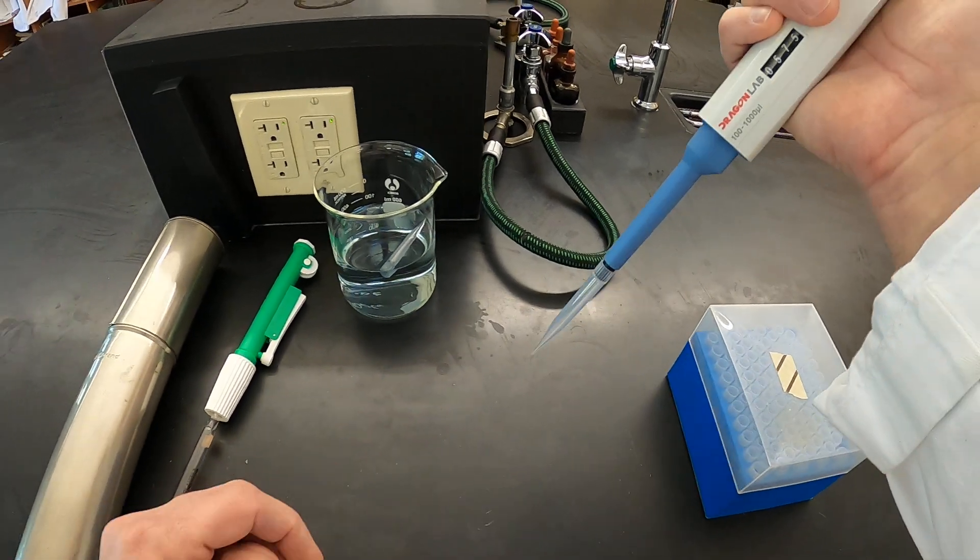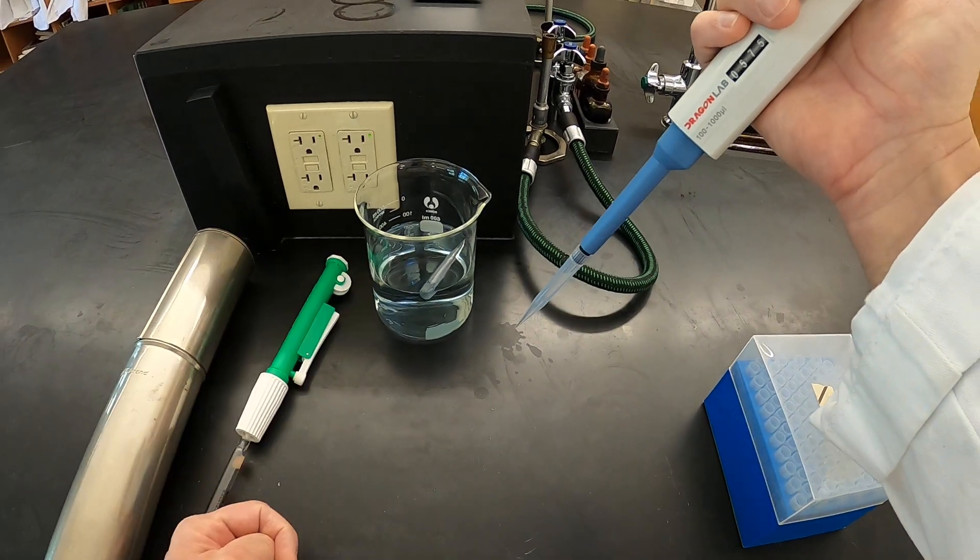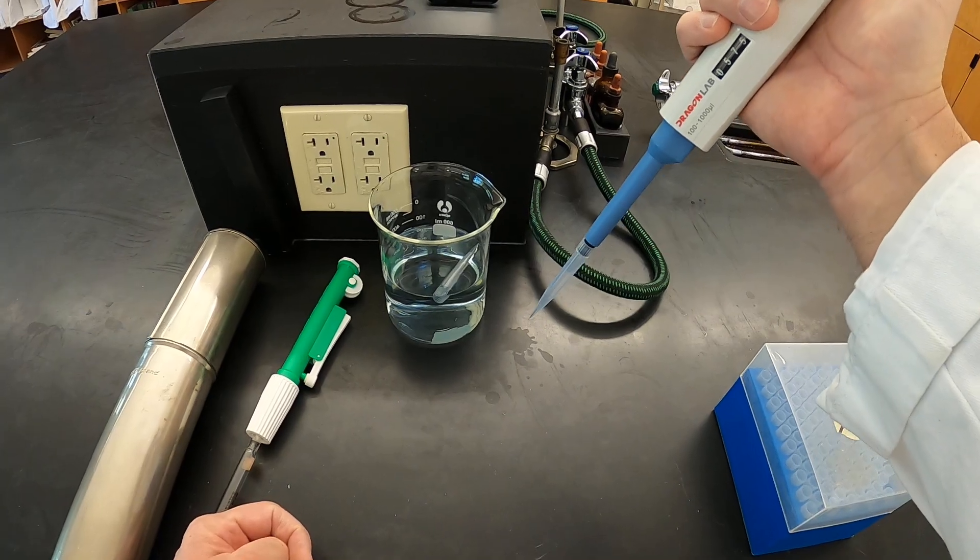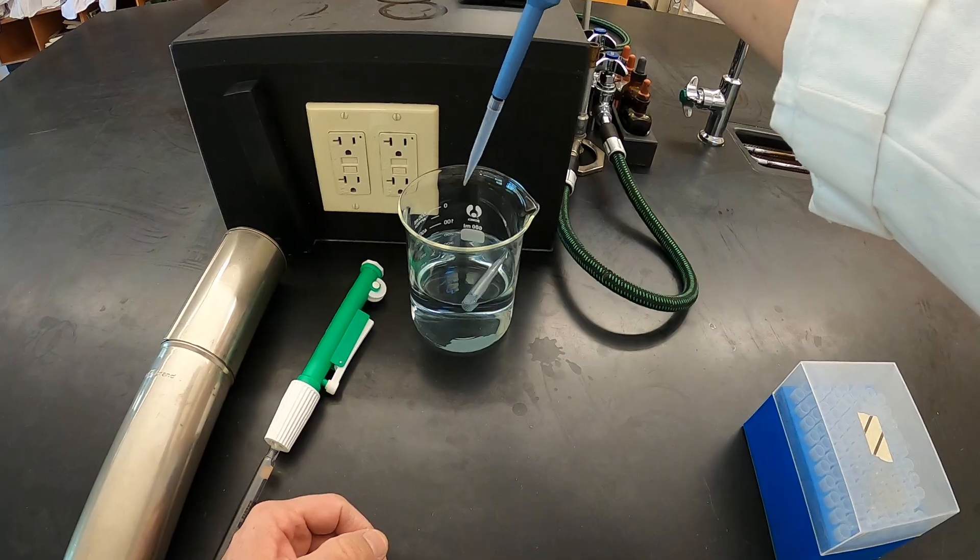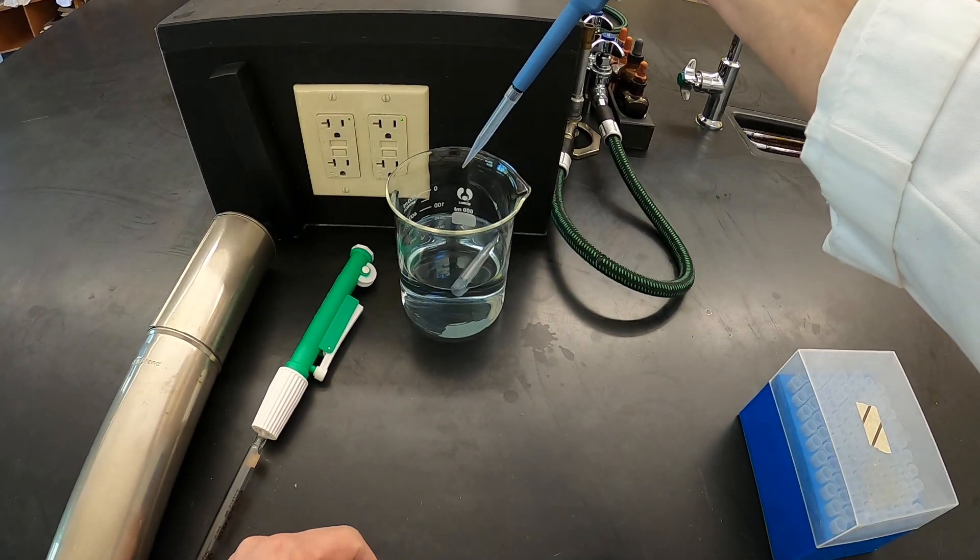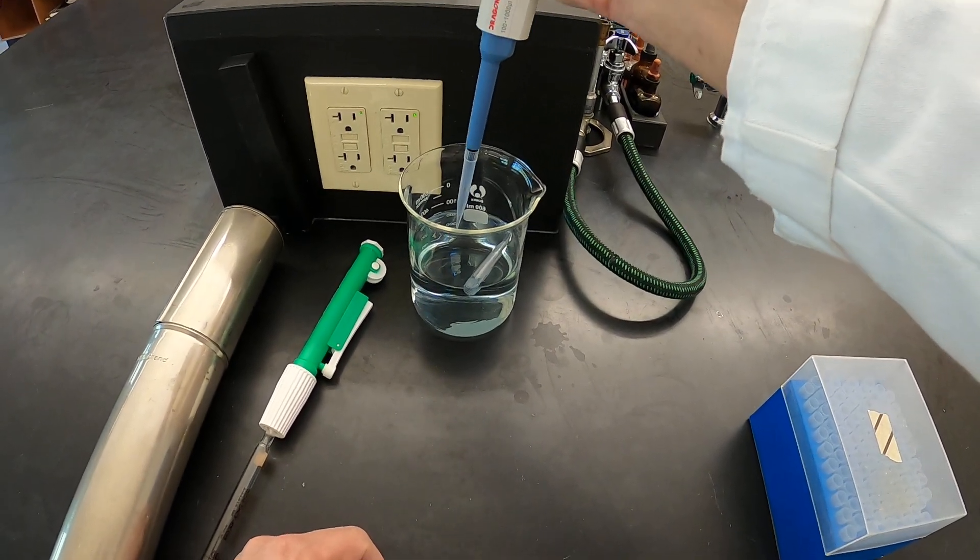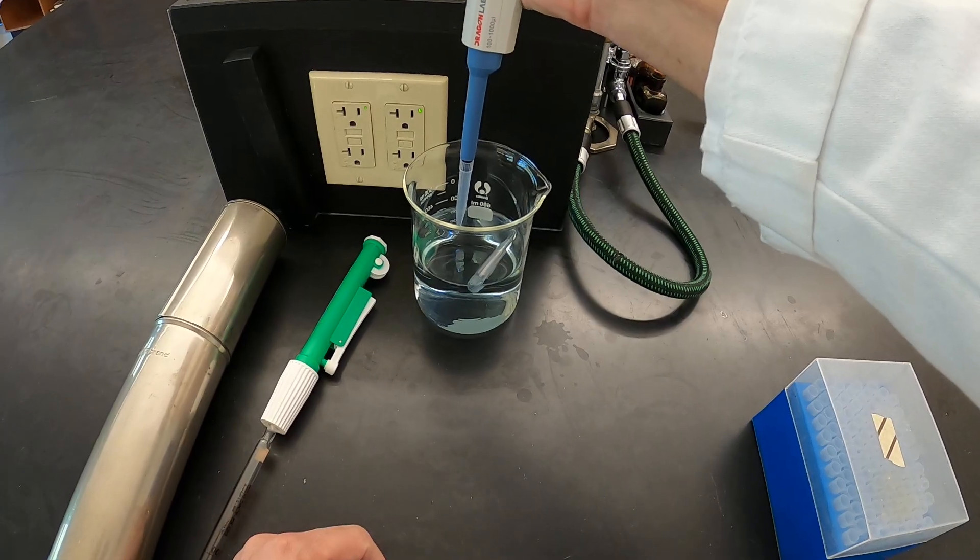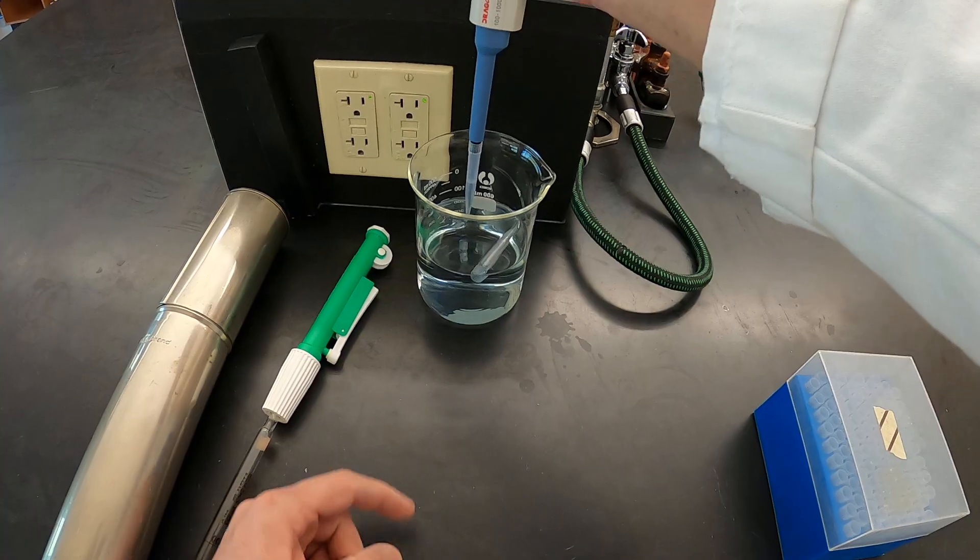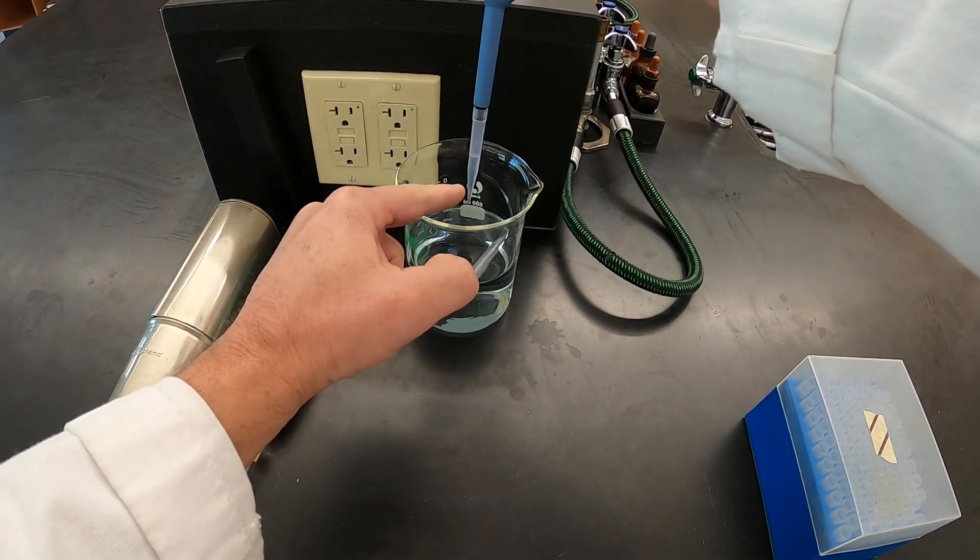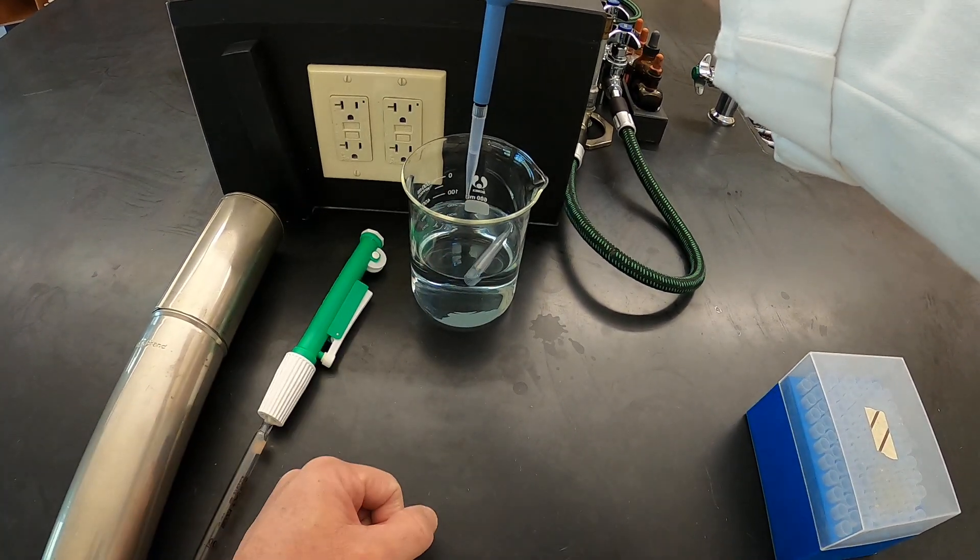So we can move the box out of the way. Let's practice here for just a second. If I was wanting to suck up 575 microliters of liquid, I would press the plunger down to the first stop. I would stick it into the liquid and then release the plunger slowly. And that is 575 microliters of liquid right there.